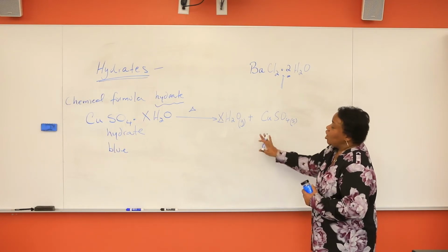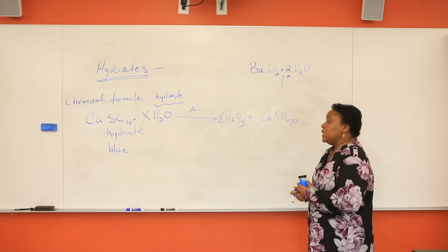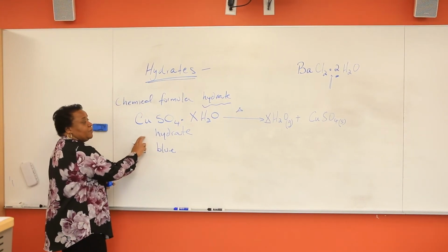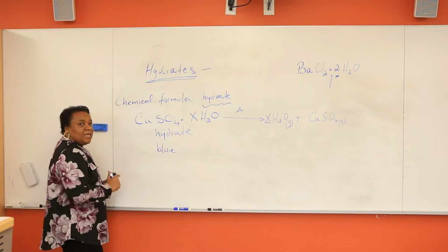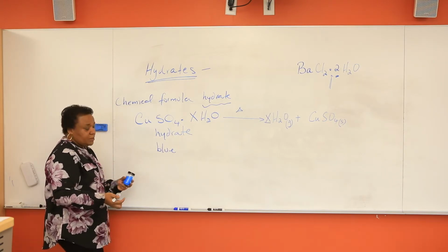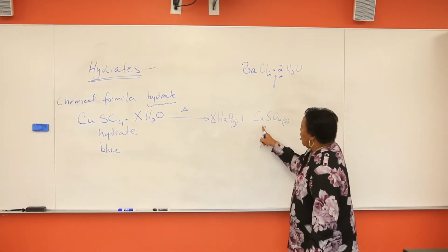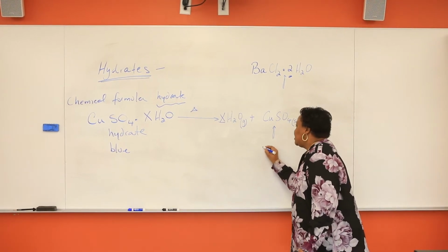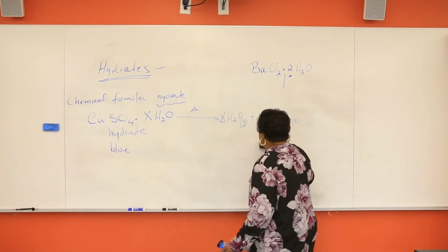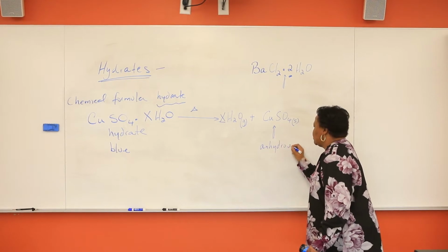And so, believe it or not, you're going to be able to use this information to determine the chemical formula. And now let's see how. Well, you will know the mass of your copper sulfate X H2O molecules at the end. On heating, what's going to happen? Water is going to evaporate. And so at the end of this experiment, please note, you will form copper 2 sulfate. And when it is void of water, when water is eliminated, then our salt is said to be the anhydrous salt.